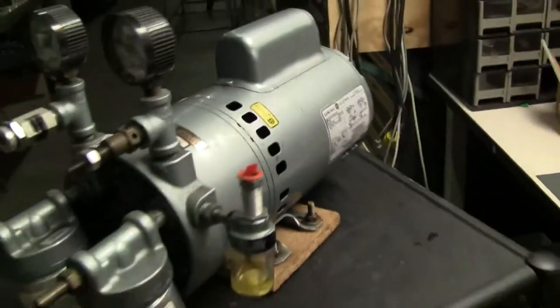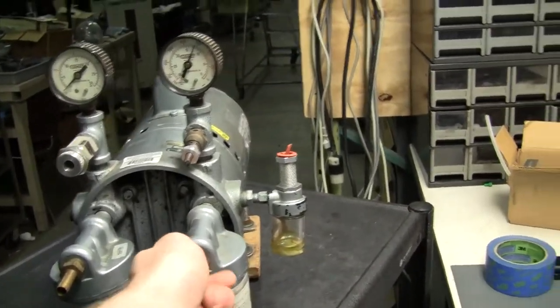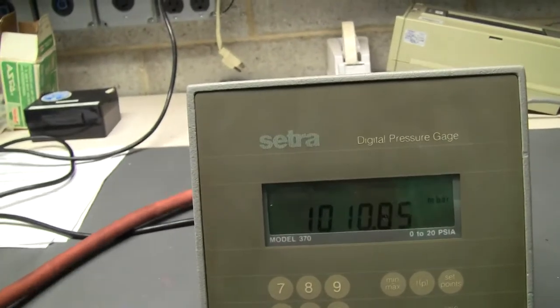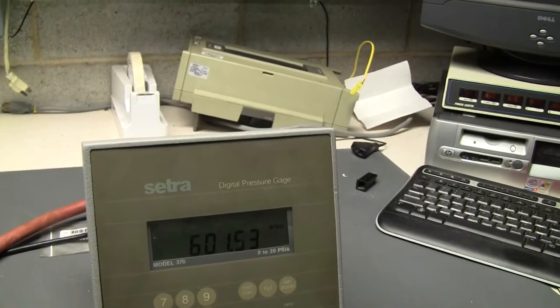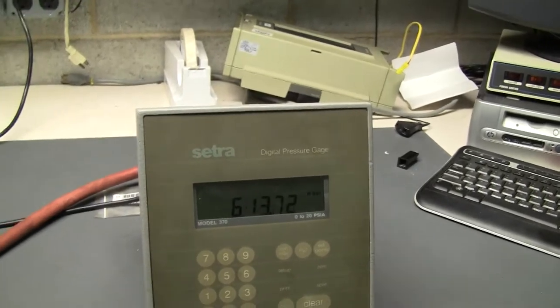Okay, we're going to pull it over here and look at the vacuum that this pulls. It pulls us down to 600 millibar, which isn't that strong of a vacuum, but it may be good enough for your purposes.